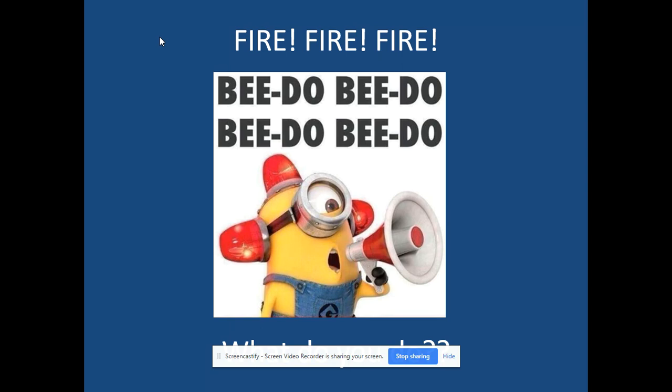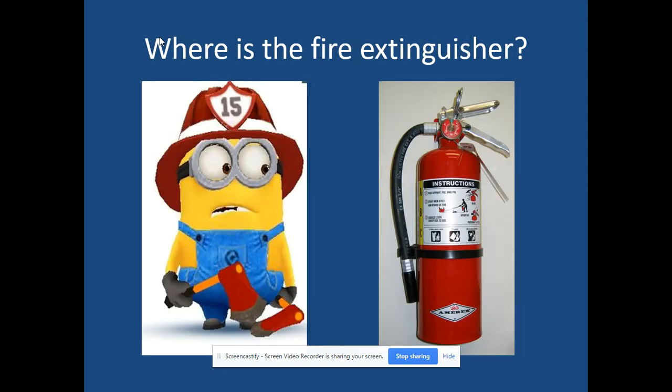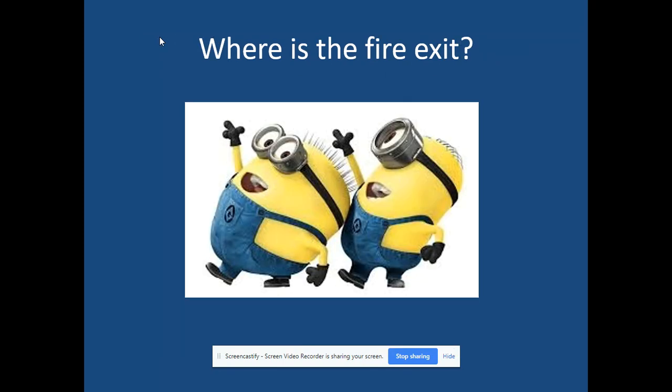If there is a fire, we need to make sure we have the appropriate materials to deal with that. We have a fire blanket in the classroom. That is good for when someone is on fire. We want to make sure we cover them, and we can't squirt them with the fire extinguisher because that would give us more chemicals. So we want to make sure we cover them and then roll them around. That blocks the oxygen from the fire and puts the fire out. The extinguisher is located near the entrance to the classroom. We want to make sure that we use that if there is fire on a non-human item.